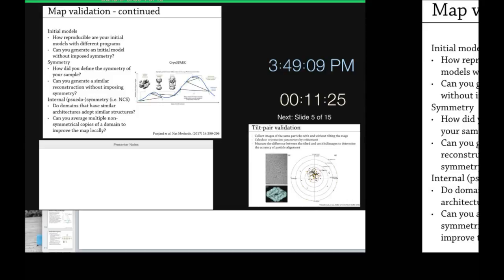And that will let you know that sometimes even within a molecule you may have 2 subunits that are the same and 2 that are different, by doing classification on individual monomers, because it's not always going to be the same subunit. Sometimes it can be diagonal, and sometimes it can be pairwise. They're going to be in different conformations. This will give you the opportunity to sort out different particles that have slightly different conformations within them, but not necessarily throughout the entire molecule.